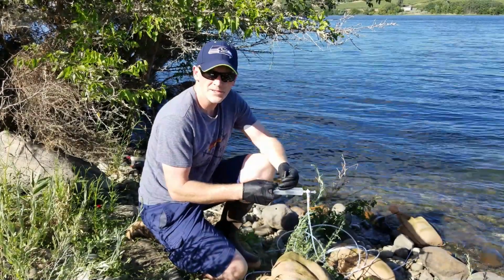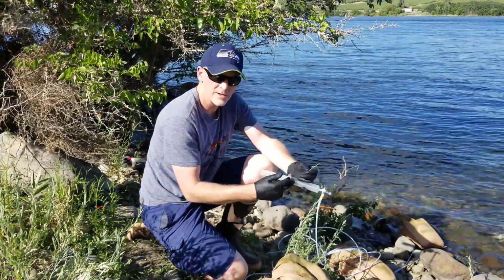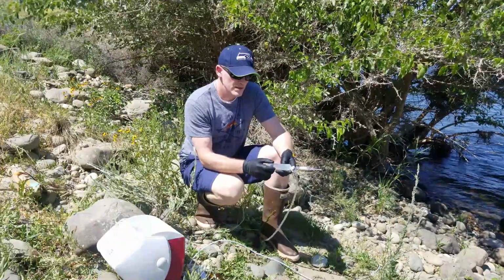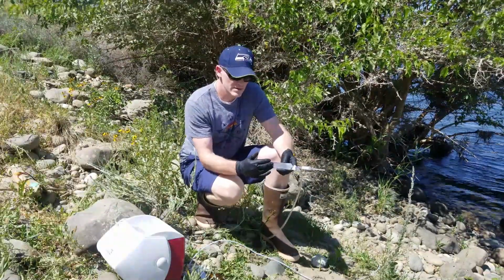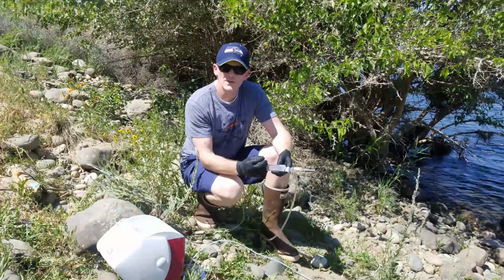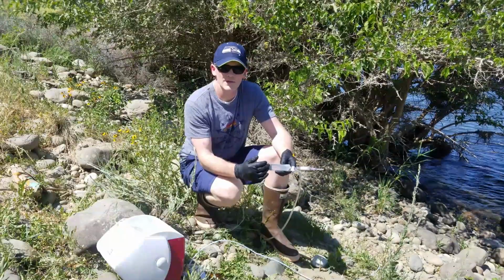So for the push point sampling, you'll have the same arrangement. You'll pull and flush, pull water into the syringe, flush it 3 times. There are a couple things that are different. First is when you fill the syringe with water, you're going to want to pull it slowly, about 1 milliliter per second. So it should be about a minute to fill a 60 milliliter syringe.